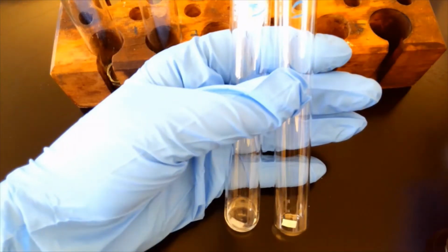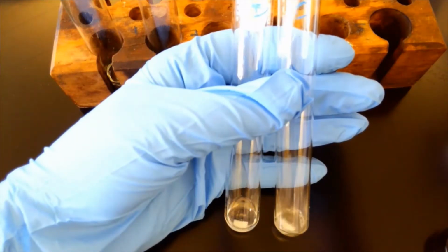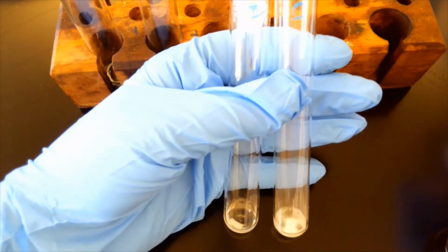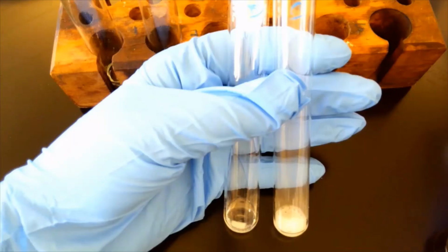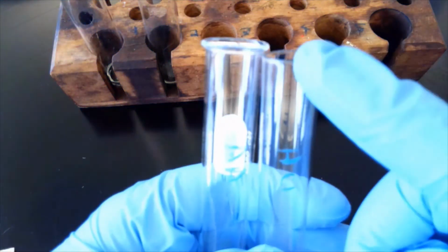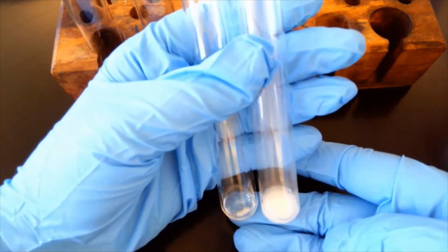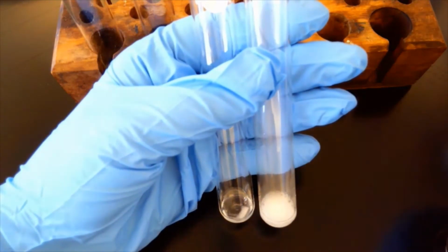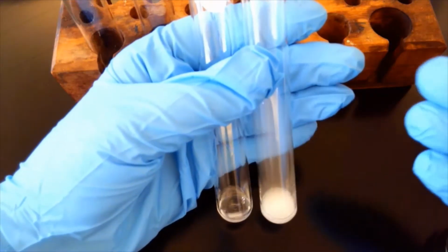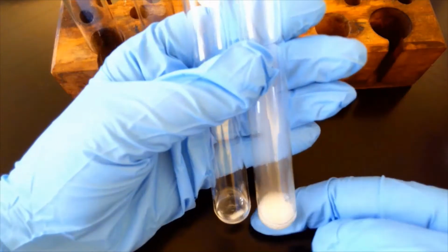Now if we add in some 6 molar HCl, same amount, I don't know if you can hear that, but holy smokes. So we can see the gas coming out of the top of the test tube in this case. And if you feel the bottom, this is really hot to the touch. It is not comfortable to hold, that's why I'm holding up here, but touching the bottom is actually really hot.